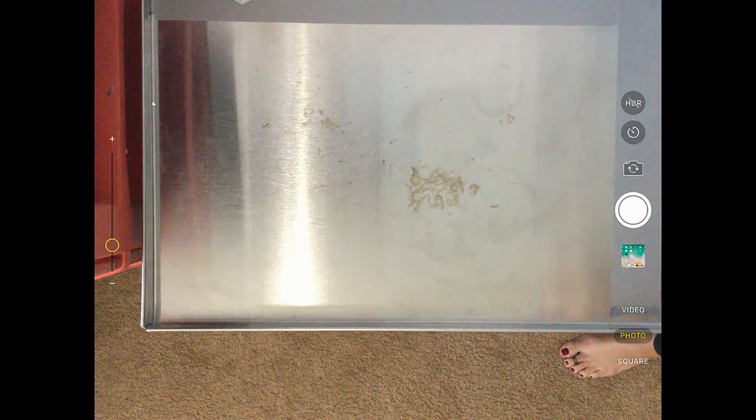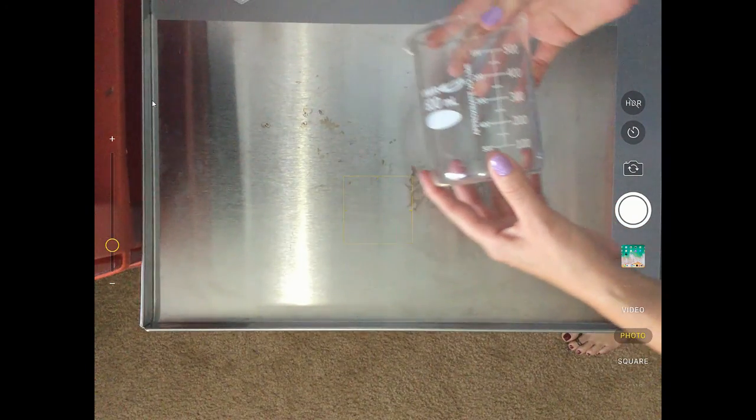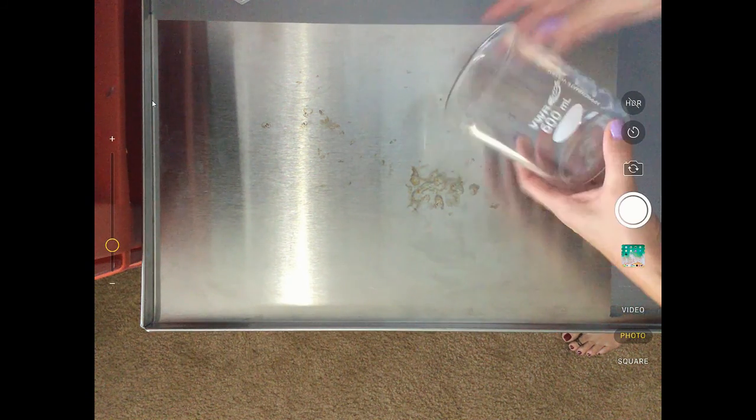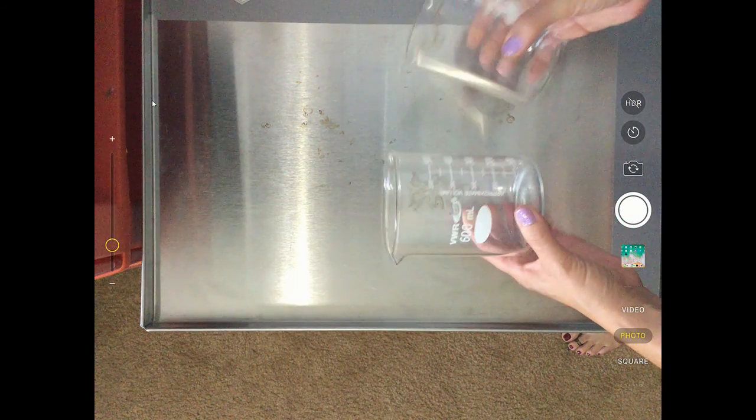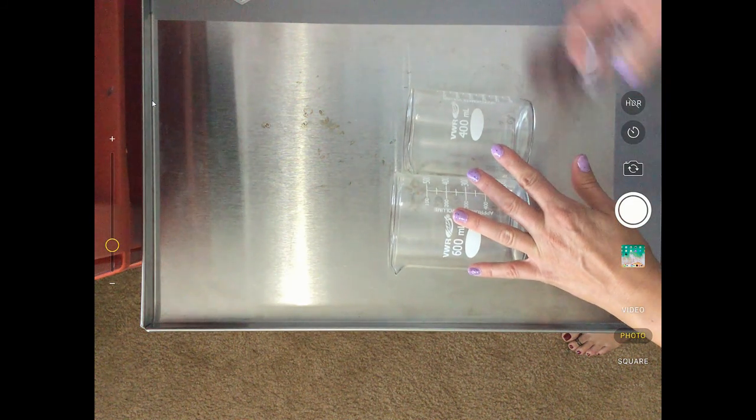Okay, so we're going to talk a little bit about lab tools. First lab tool that I want to show you is a beaker. This is a beaker. They do come in different sizes. I would say this is a medium, this is slightly smaller, and this is a baby beaker.